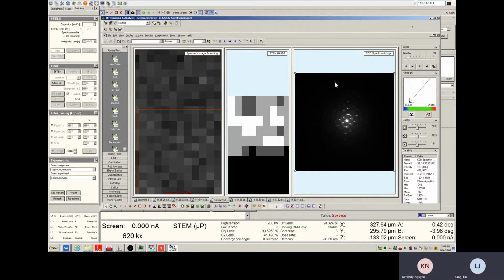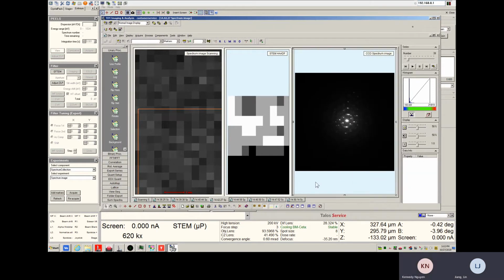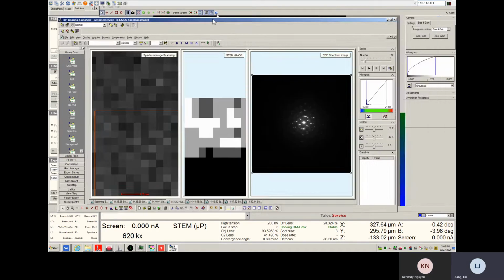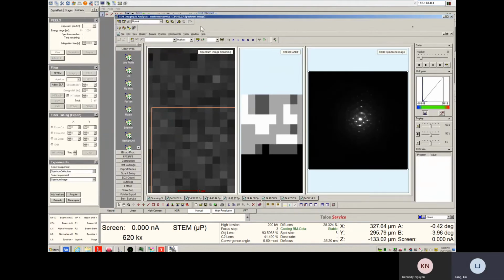Yeah, so you probably can. ImageJ, you can open a stack image, right? So if you save the data, for example, I want to save this data, you can go find, save as. Okay, it's this one. Let's make sure I select the right one.